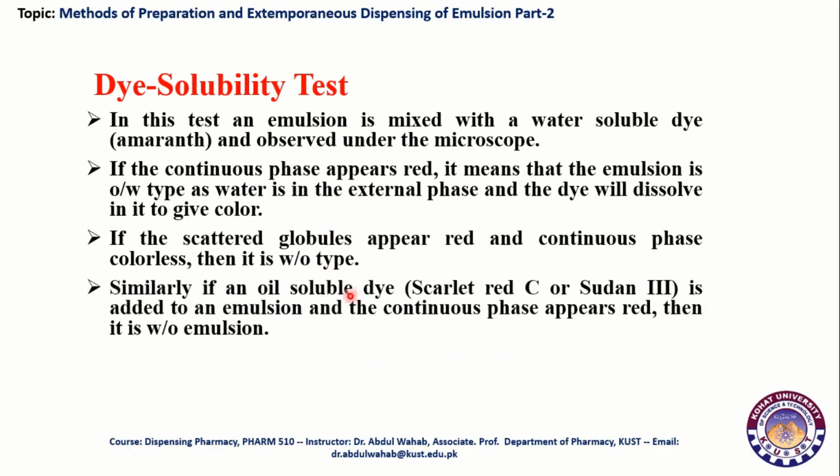Similarly, if an oil soluble dye like scarlet red C or Sudan III is added to an emulsion and the continuous phase appears red, then it is a water in oil emulsion.